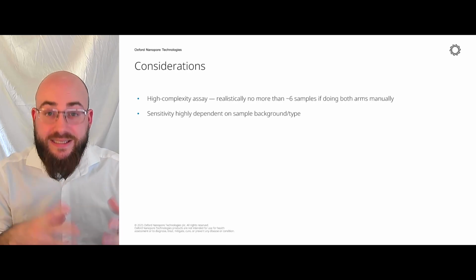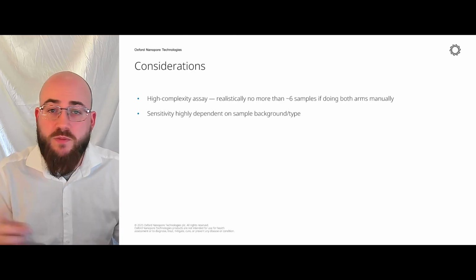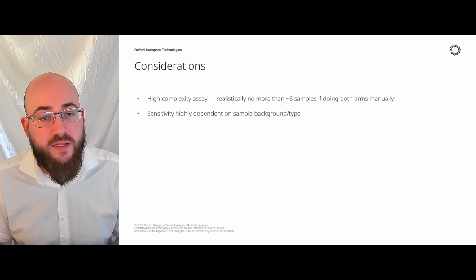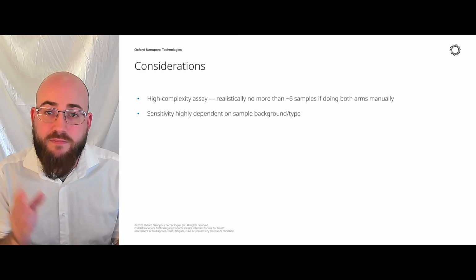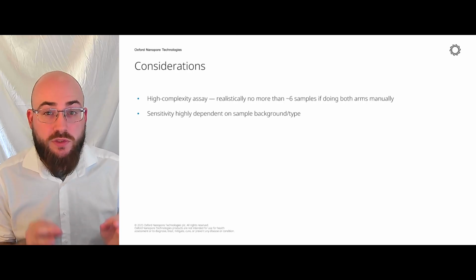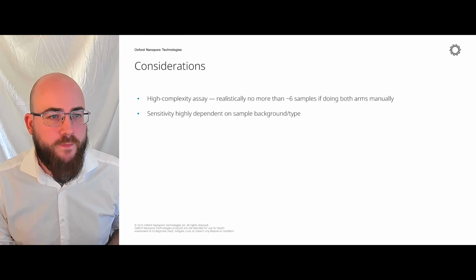Firstly, how much is in the background of our sample, because one sputum is not going to be the same as the next sputum. They're going to have different amounts of background in them. But also, if we're doing different sample types, you don't have to use sputum for this. Different sample types will have different background. But that really emphasizes the importance of having a really good depletion method, okay? So that's why we're doing this the way we are.